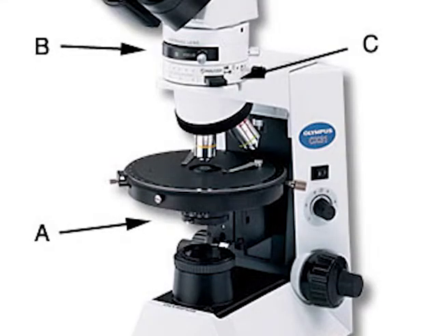It involves the use of polarized light. The basis of this technique is the wave nature of light. Polarized light microscopy is based on the fact of the polarizing light. In a polarized microscope, there are two filters. One is a polarizer while the other is the analyzer. Light from the source moves towards the polarizer and then is analyzed at different positions of the analyzer. That is, the two filters can be rotated in different positions depending on which the spectrum will be formed.